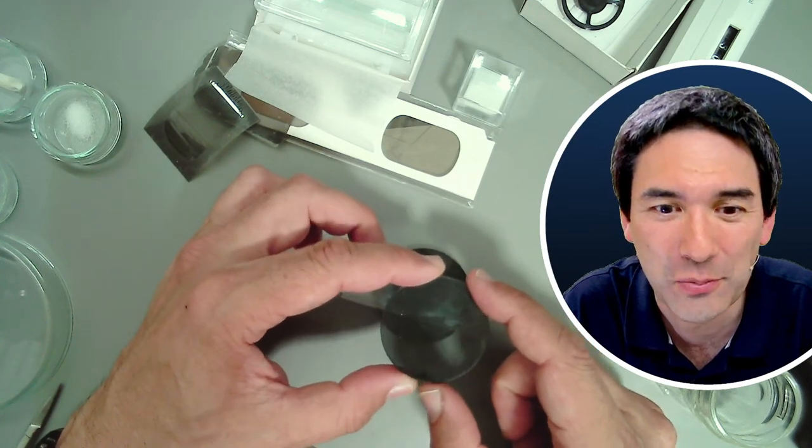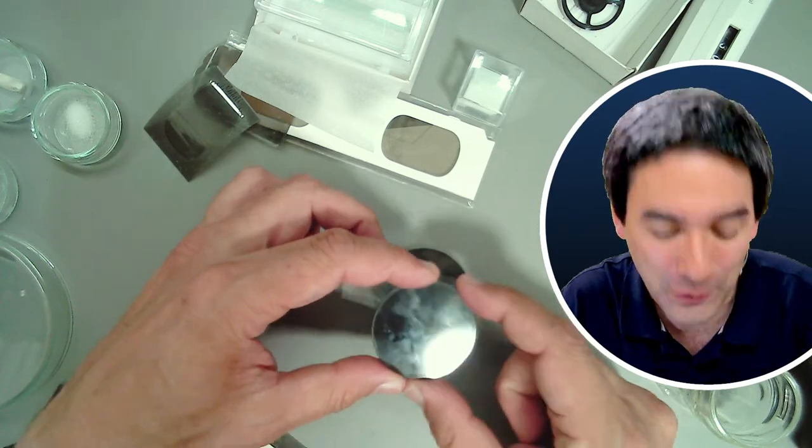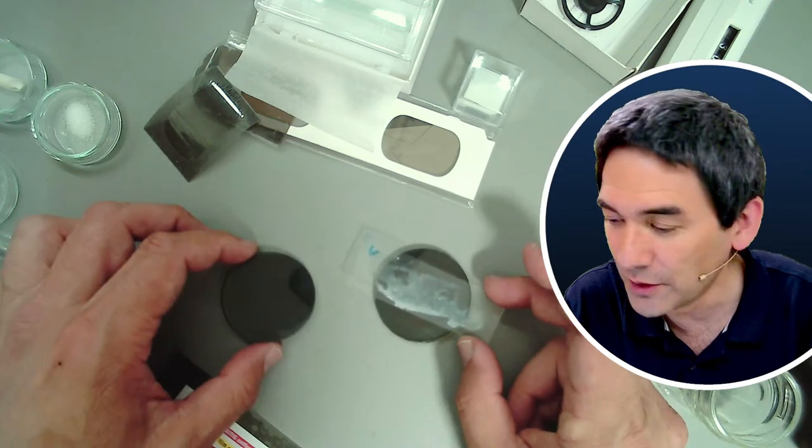If you have not guessed already, over the last couple of live streams, I've also been using stereo microscopes quite a bit. The reason is I want to make them also more popular. Stereo microscopy is also quite nice. So this is basically something that I want to do.